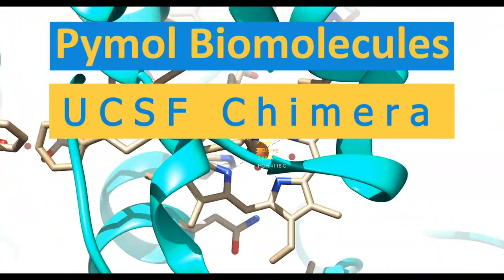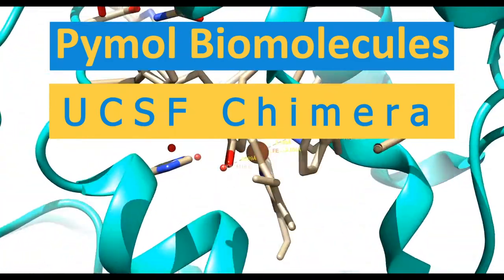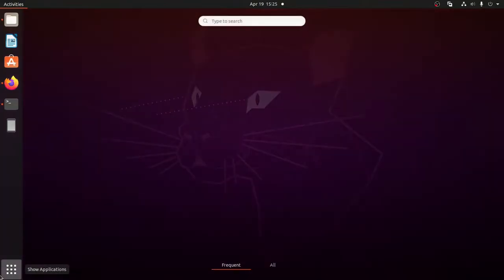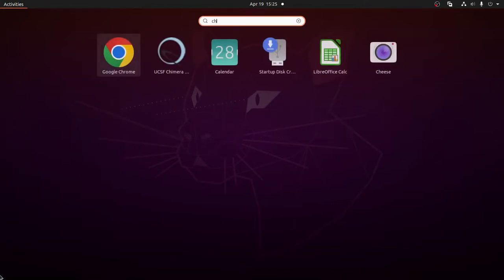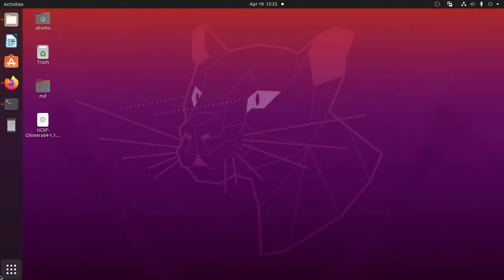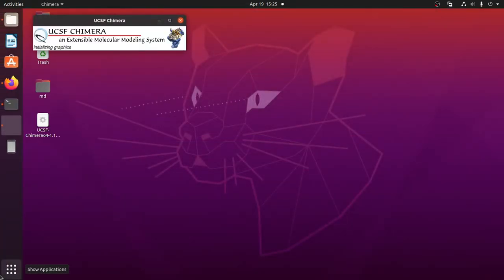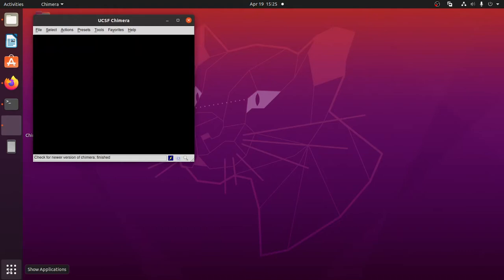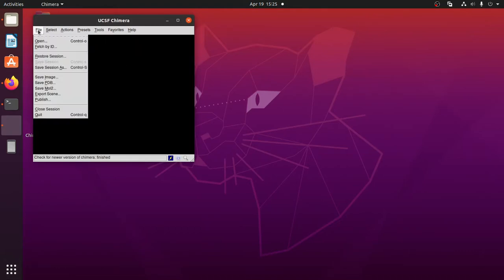Welcome everyone. In this video, I'm going to show you how to install UCSF Chimera software in Ubuntu Linux. UCSF Chimera is a free program used for visualization and molecular structure analysis, docking result analysis, MD trajectory analysis, and conformation analysis.